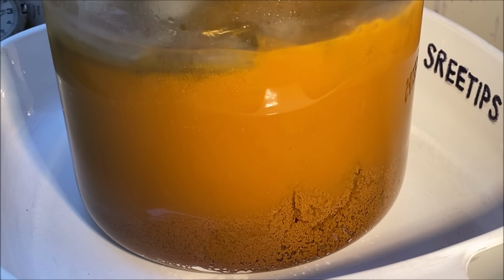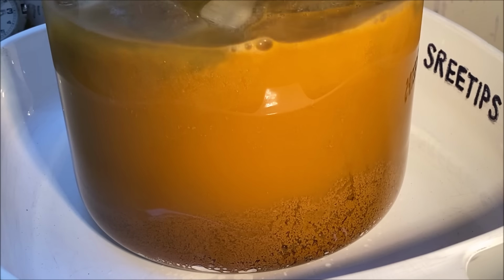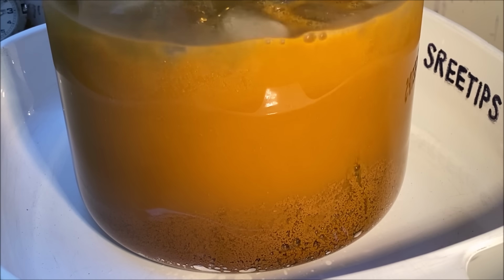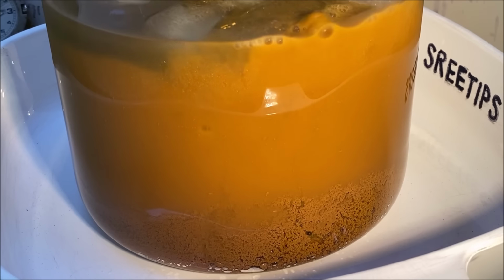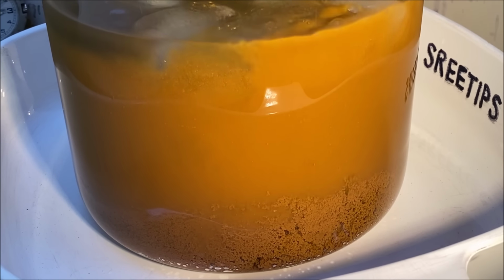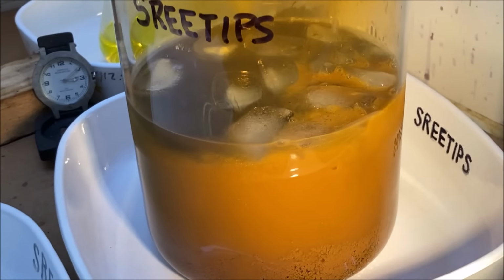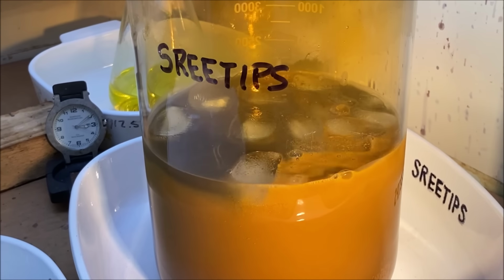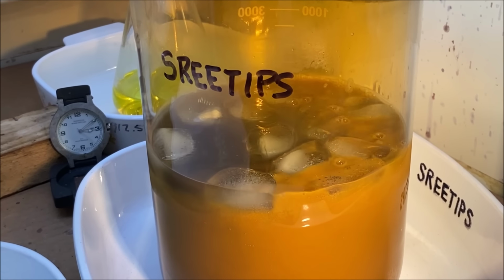See, the gold is formed down on the bottom of the beaker there. It's got some bubbles going on. What that tells me is you may have some excess nitric in there. You can tell by the fume production that's coming off the top there.